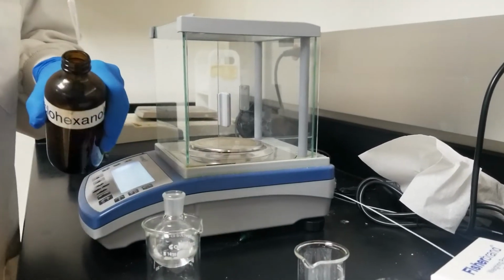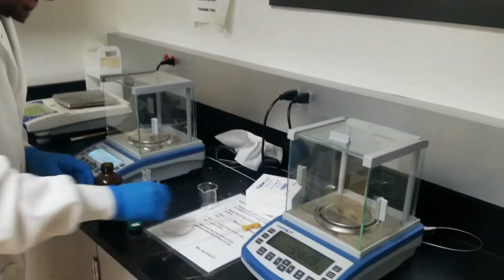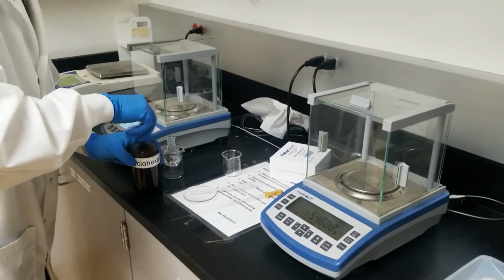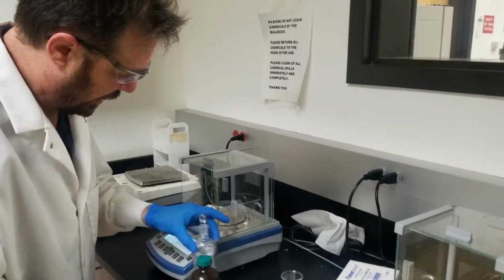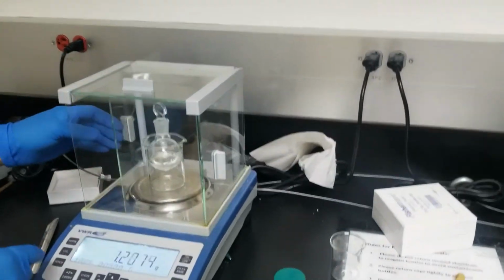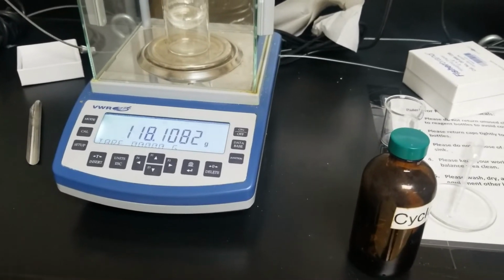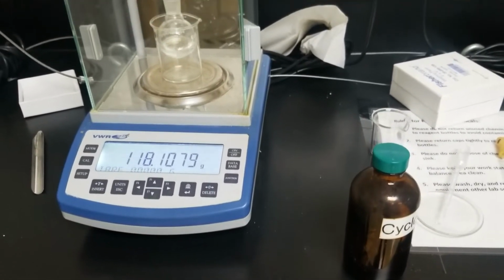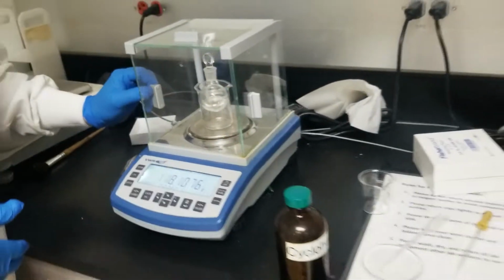Okay, so let's see what that registers over here. I'm using a watch glass to put that on. Cap this up for a moment. Put a lid on it. Now we had the 8 there. Okay, so that's about 10 grams. So with the density, we're not quite there yet. So let's put in another squirt.